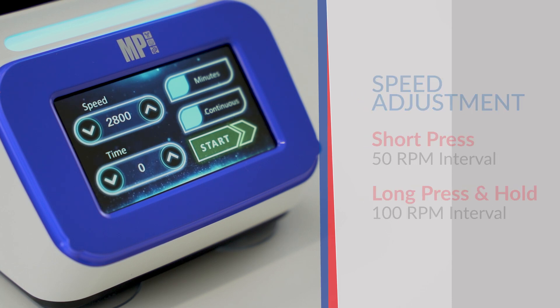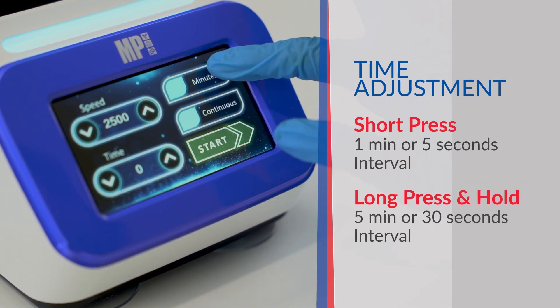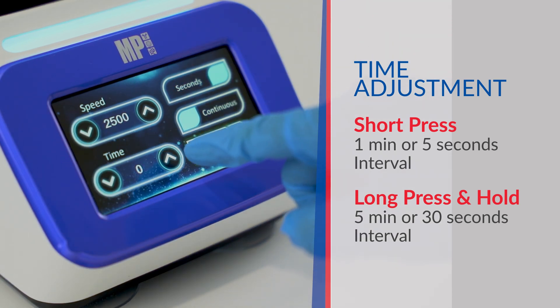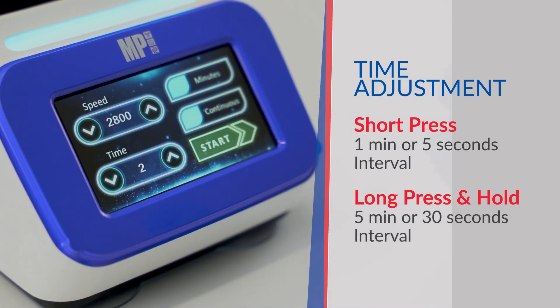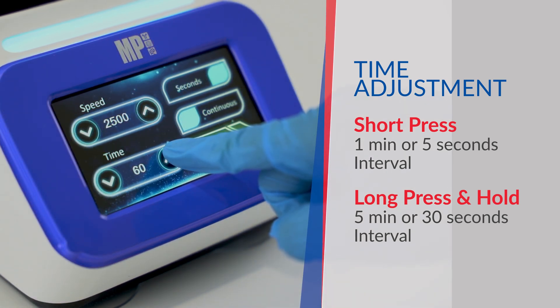Similarly, the adjustment of vortex duration is also very simple. Simply select the countdown time to be in seconds or minutes. Press the arrow to adjust the increment or decrement of the time period by one minute or five seconds, or long press the button to change the time interval by five minutes or 30 seconds.